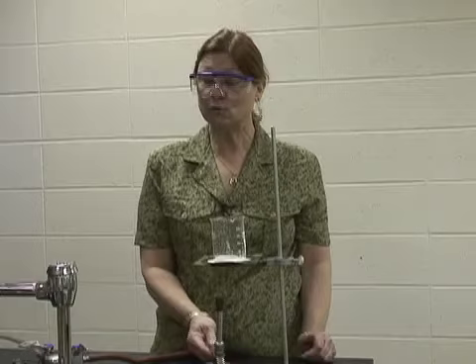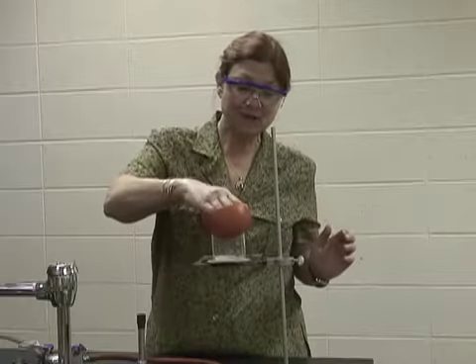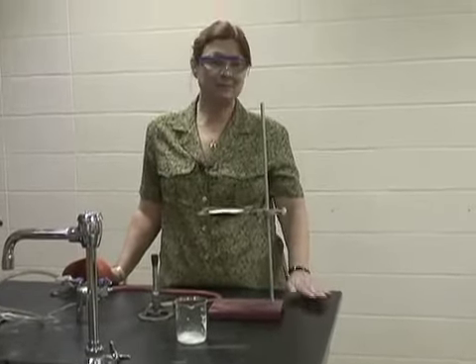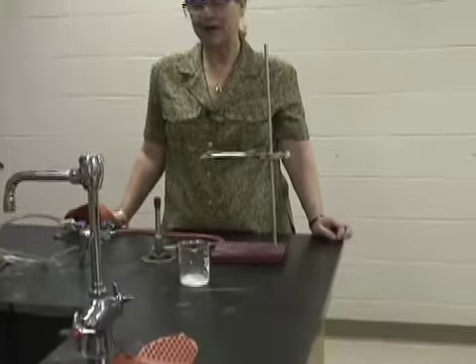Now we need to let it cool. And I could take it off of here. These are hot hands. I'll take the beaker off of the ring stand and I'll just set it here. And these tables are designed to take hot materials. And therefore it's safe to put materials down there.